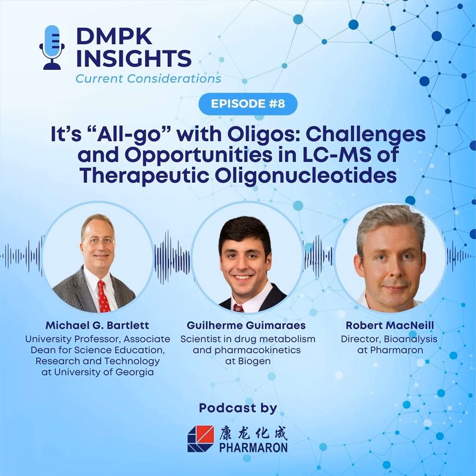I think nano LC, that's going to be tough. Mostly just because I think the run times are just going to be so extraordinarily long, and it's going to be too damaging to throughput for people to move to that very quickly. But again, I think a lot of this really is also going to come down to that we don't really understand the retention mechanisms in HILIC that well yet.